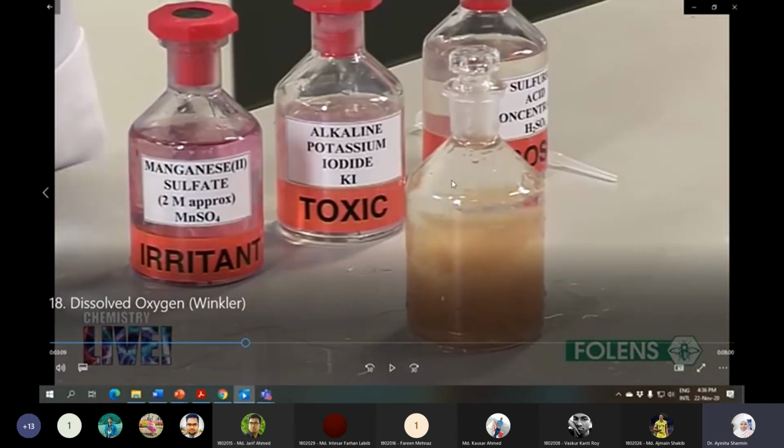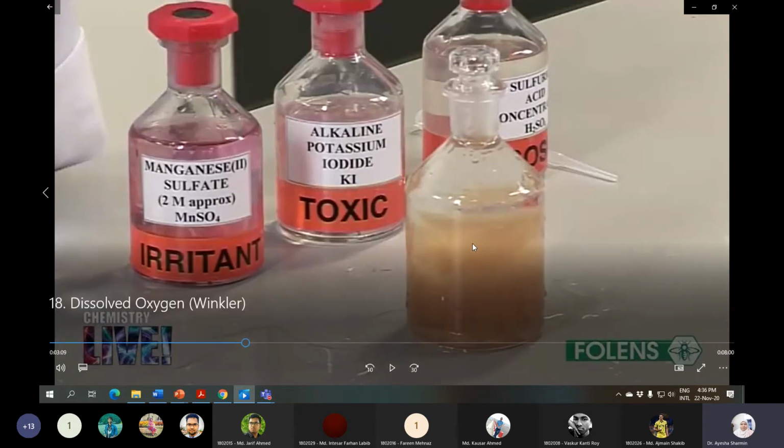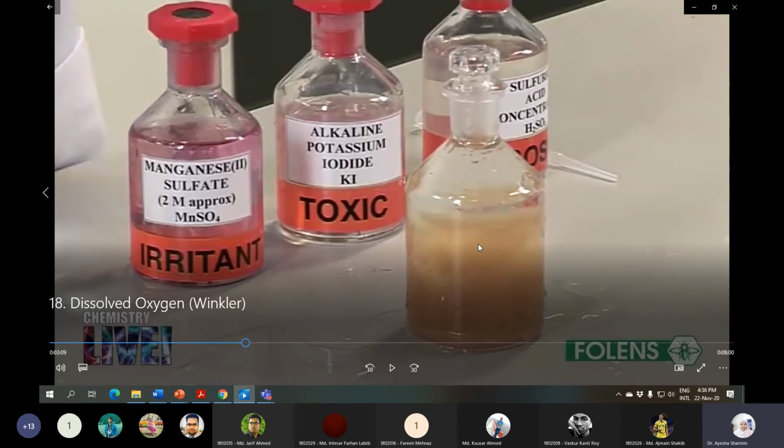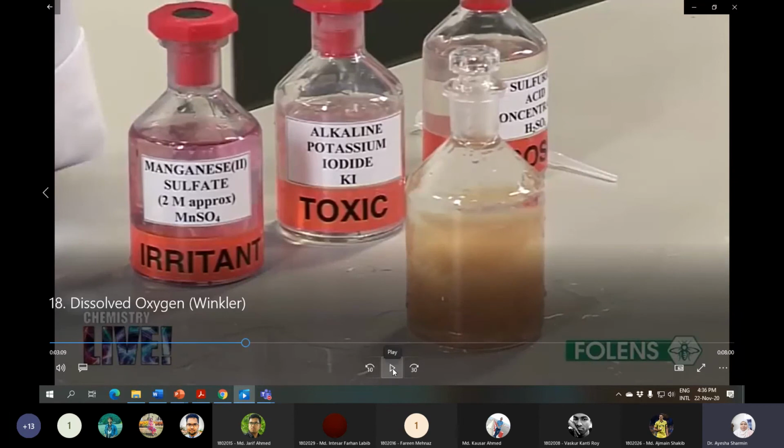If you have a very nice clean solution, you'll see that the solution is still colorless at the top. Only the brown precipitate you can see in the bottom. This is only because of the color of the MnOH3. MnOH2 is white, but MnOH3, where the manganese is +3, or you can have MnO2, that's slightly brown. So that will give you the brown color, okay?